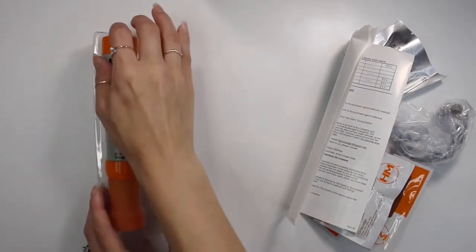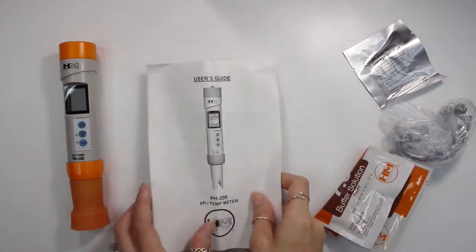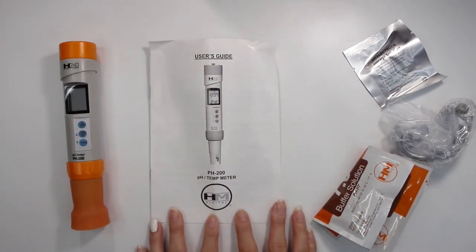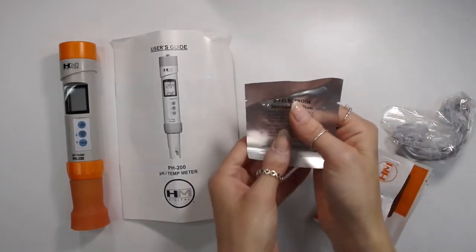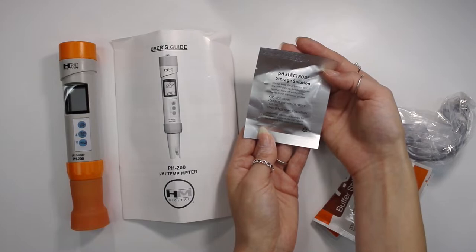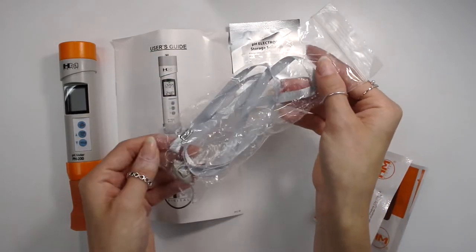So this comes with the pH meter itself, and it comes with a user guide — I recommend reading everything in this user guide before using it because this is a more in-depth pH meter. It also comes with a pH electrode storage solution, which is very important. We'll talk more about that later in this video. There's also a little lanyard to wear your pH meter as a necklace if you want to.